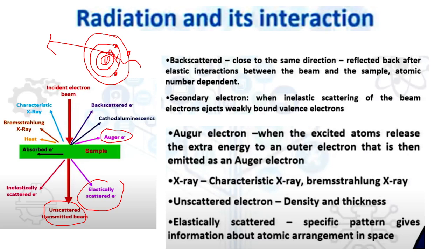Now since it is the closest one to the nucleus, it cannot remain as a hole, there should not be any vacancy. In that case, another electron from a higher shell will come down, and when it comes down, the excess energy will be released. That excess energy can be applied in different physical phenomena.